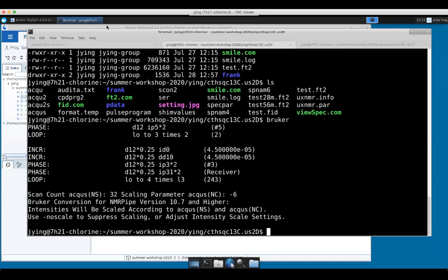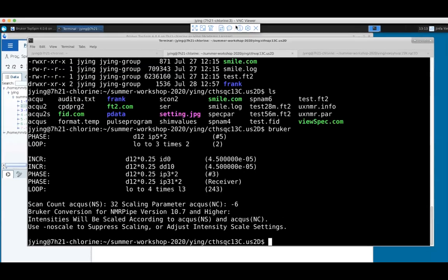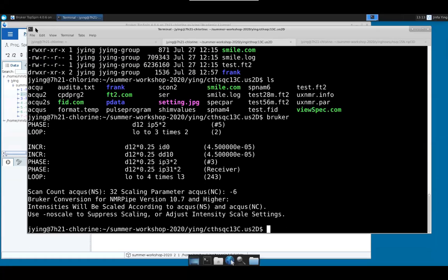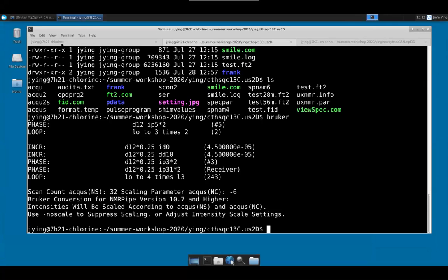Gonna get started, Adam. I'll share my NMRbox screen. So, this is TopSpin. Okay, hold on. Where is it? My box. How do I go? Oh yeah, here. Okay. I have a TopSpin running, and I'll use it briefly for showing some of the data.